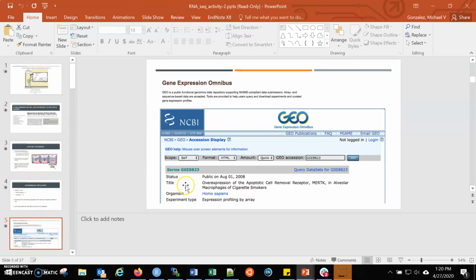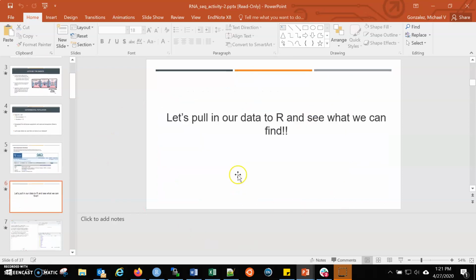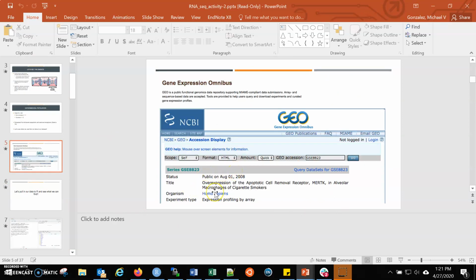way up at the top here, this will consult the Gene Expression Omnibus database. And we can actually go here. This is one of those databases stored within NCBI that we've been working with for sequencing data. Because this microarray and sequencing data is kind of all in the same boat, we consult this database here, and we can look at the specific study that it came from.